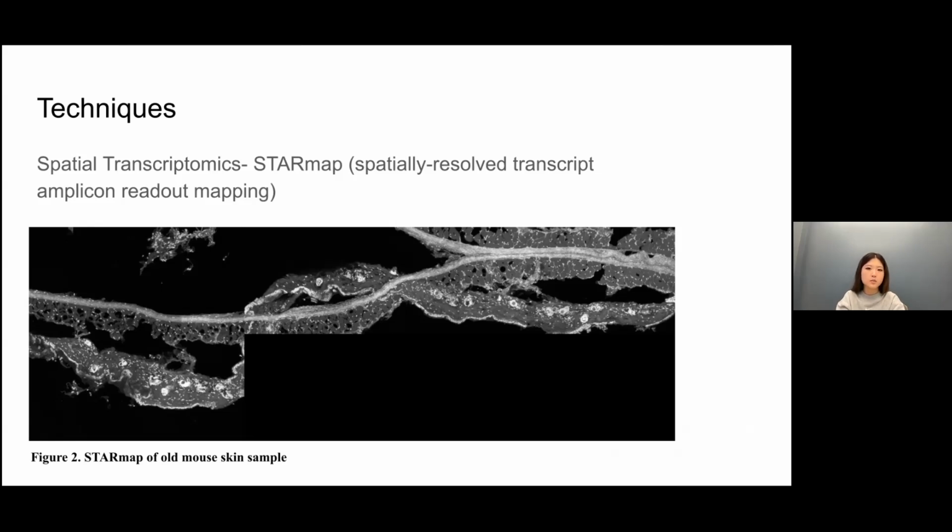Then we use the SNAIL probes, and these probes specifically bind to the RNA molecules we're interested in. And once the probes are attached, they amplify the signal by creating what we call DNA nanoballs or amplicons. This amplification step ensures that we can detect even the tiniest amount of RNA with great accuracy. Then we come to the sequencing part, and STARmap uses a special method called SEDAL, which stands for Sequencing with Error Reduction by Dynamic Annealing and Ligation. It's a fancy way of saying that we're reading the gene sequence inside the tissue, but we're doing it in a way that reduces error and background noise.